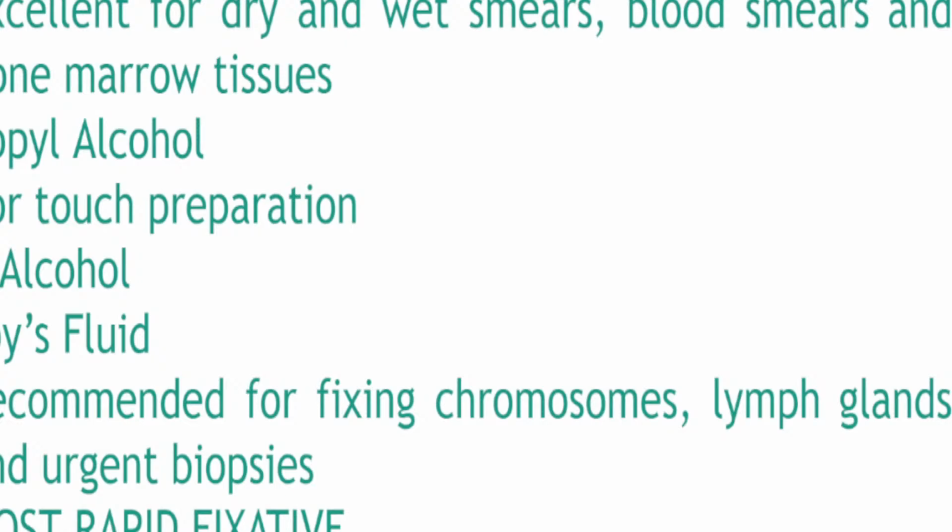And Carnoy's fluid is very much used, mainly because it doesn't have that much health hazard, as well as environmental hazard. It's not explosive. That's the reason why a lot of big laboratories that process a lot of tissues have a stock of Carnoy's fluid, because it's a rapid fixative.